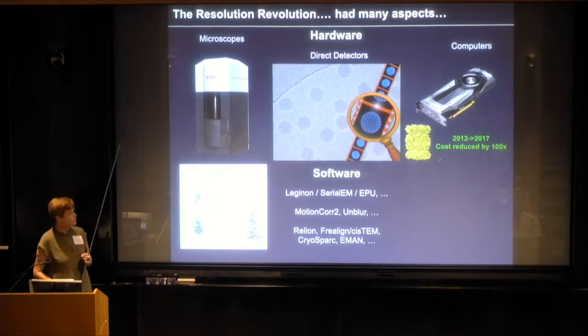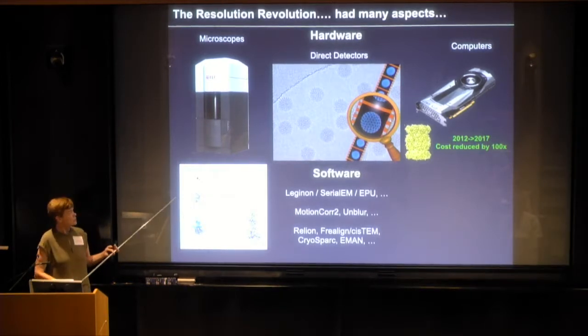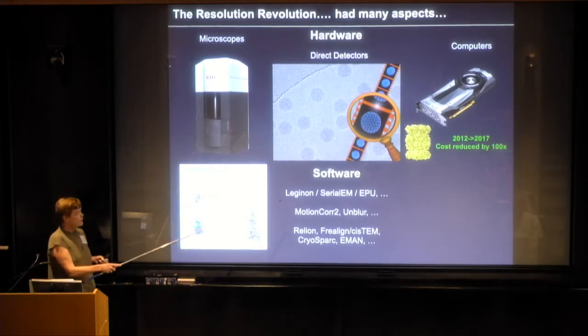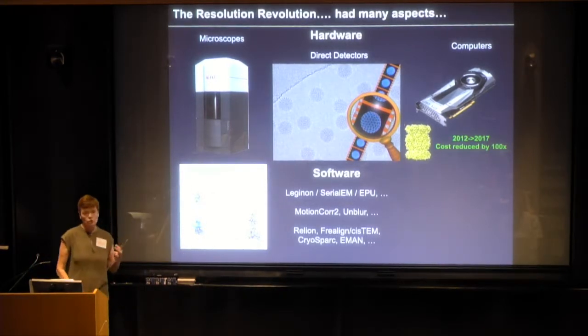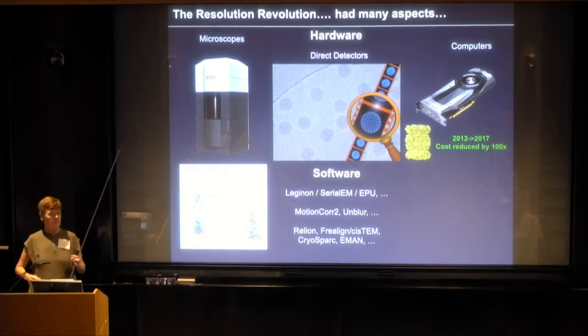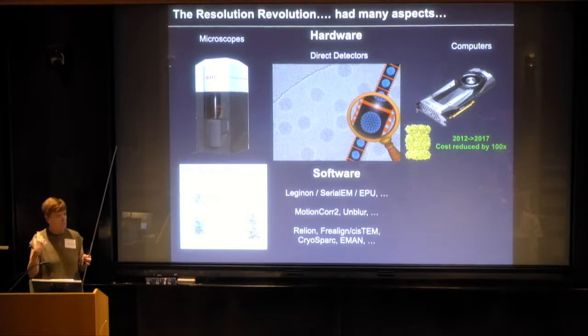And then you pull particles out of there, 2.8 million particles in this case. So we have to automate that whole process. And my group did that many, many years ago. There are now many other packages to do that too. It's kind of a solved problem. I don't think anybody sits at a microscope and does anything manually anymore. It all gets done automatically.